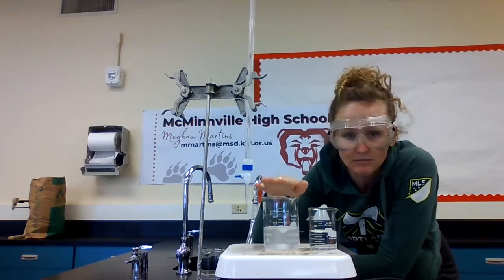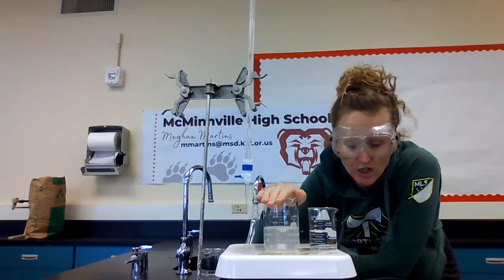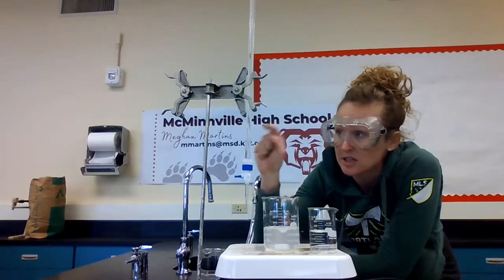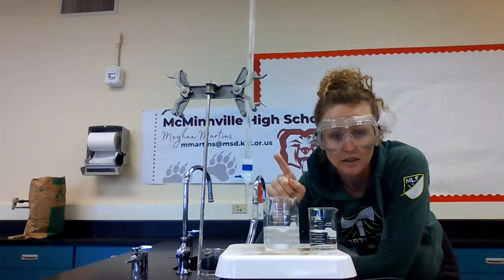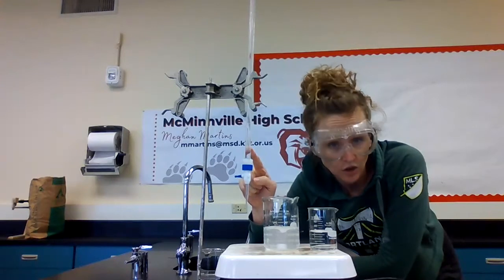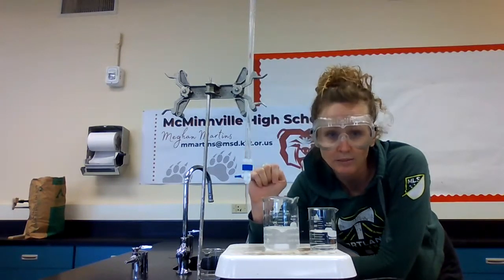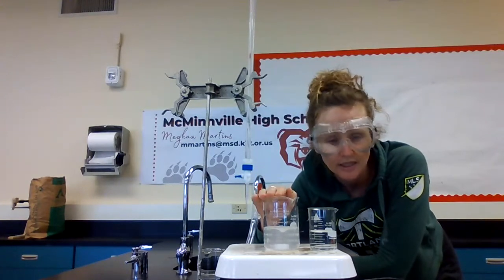I didn't measure out my acid very carefully, but if this was a real titration, you would need the volume of whatever's in your beaker, and the volume of whatever's in your burette. You also need the concentration of one of them. One of them is your unknown, and one of them is your known. You need the concentration of your known.